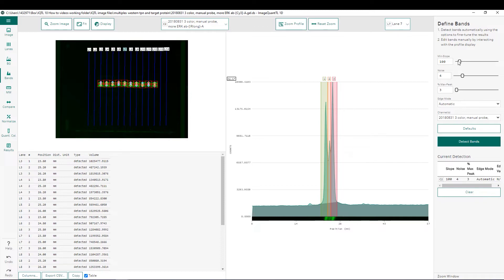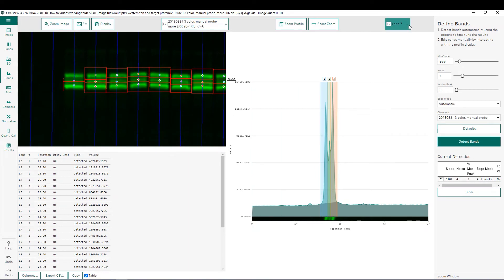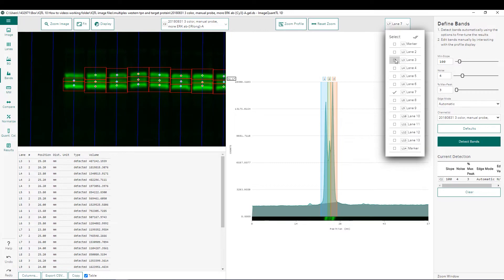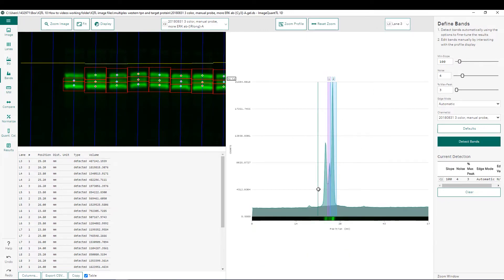We can also manually edit the detected bands in the image. For example, if one of these bands needs to be deleted, simply right-click on that band to delete it. To add a band back in, we can do so either from the image or from the intensity profile. We can choose to display lane three where we just deleted the band, and add it back in the intensity profile shown there.